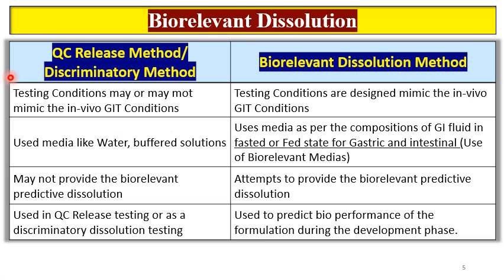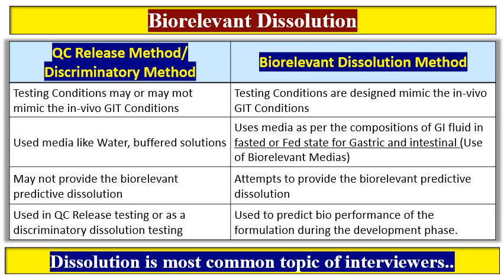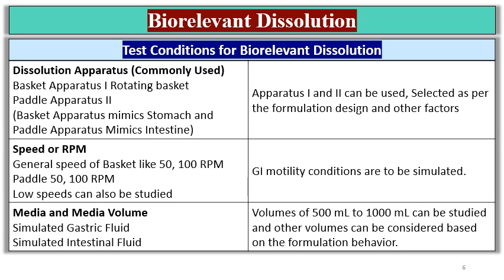And biorelevant dissolution method is used to predict the bioperformance of the formulation during the development phase, before going to the pilot or pivotal BE studies.